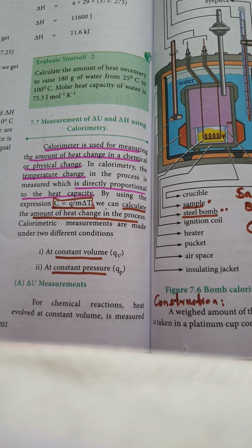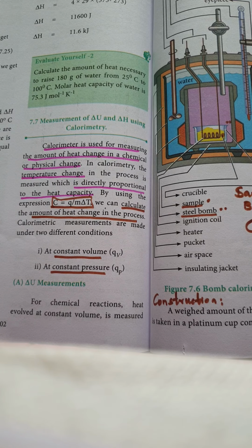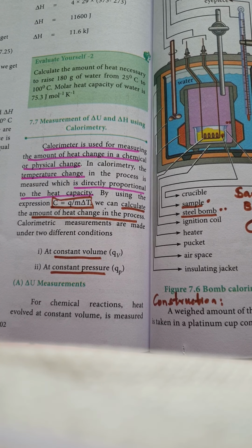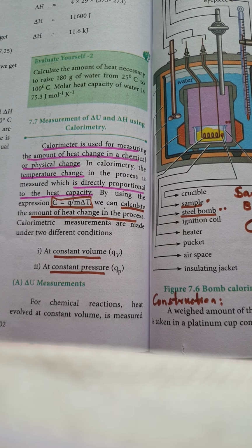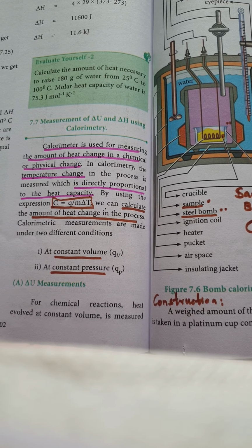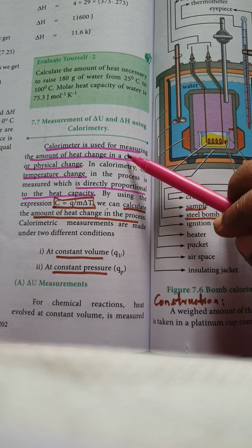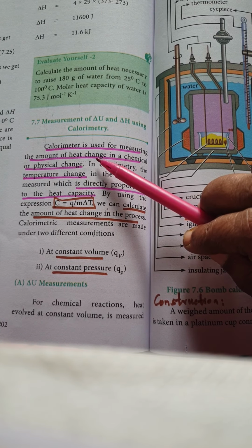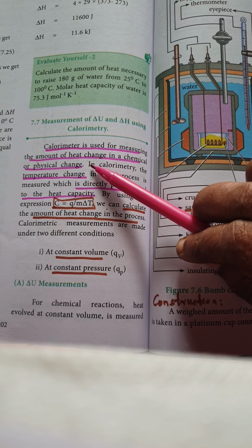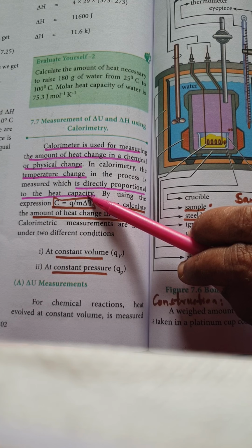Hello, good morning, students. Today you're going to learn about how to measure the change in the heat energy, enthalpy, and internal energy. We are going to use an instrument called a calorimeter. A calorimeter is used for measuring the amount of heat change during a chemical reaction, and the temperature change is directly proportional to the heat capacity.